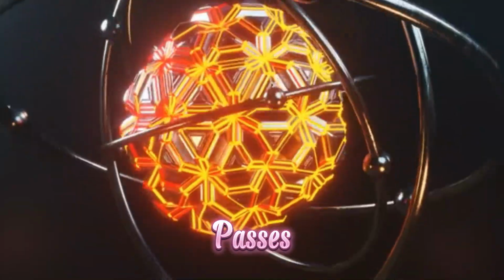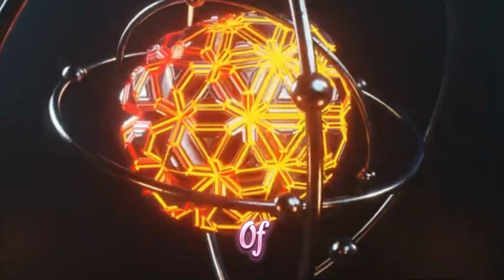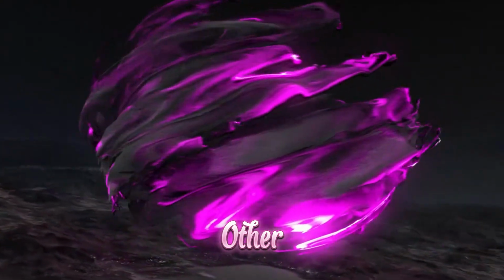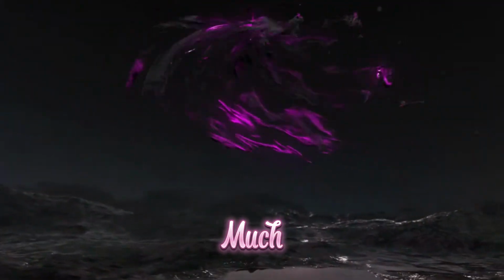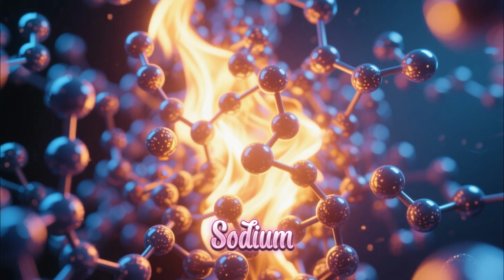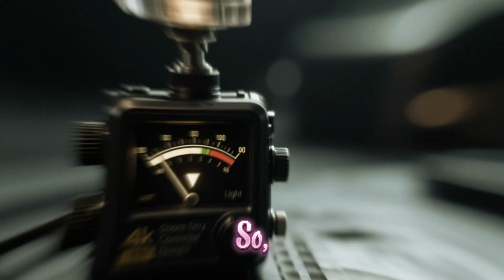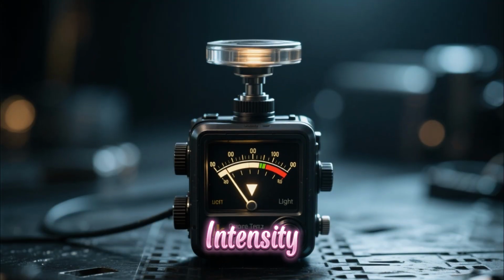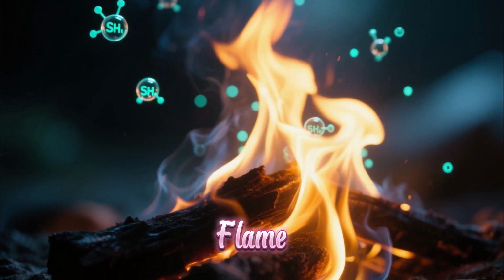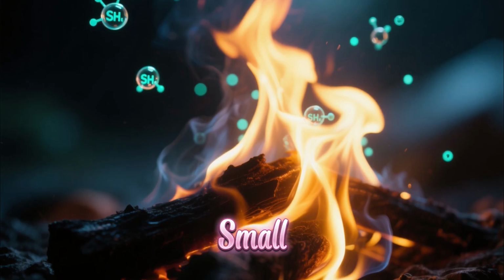As this light passes through the flame, the sodium atoms floating in there get excited and absorb some of that light. They're basically gobbling up their favorite color. On the other side of the flame, a detector measures how much light made it through. If there's a lot of sodium in our sample, many sodium atoms will be in the flame, and they'll absorb a lot of light. So the detector will see a big drop in the light's intensity. If there's only a little bit of sodium, fewer atoms will be in the flame, they'll absorb less light, and the detector will see only a small drop.